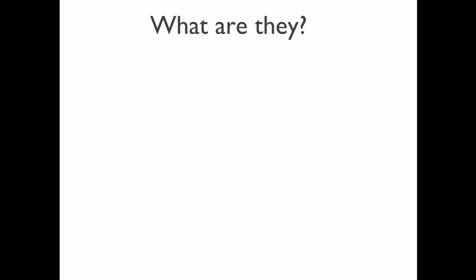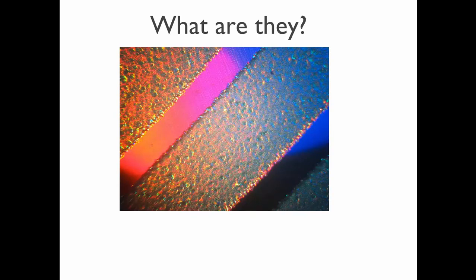The eye. All right, let's see if we can identify some things. The diaphragm. Anyone, raise your hand if you want to take a guess. So these are all images taken under a microscope. They're everyday objects that you're probably familiar with, although you might not be able to recognize them.